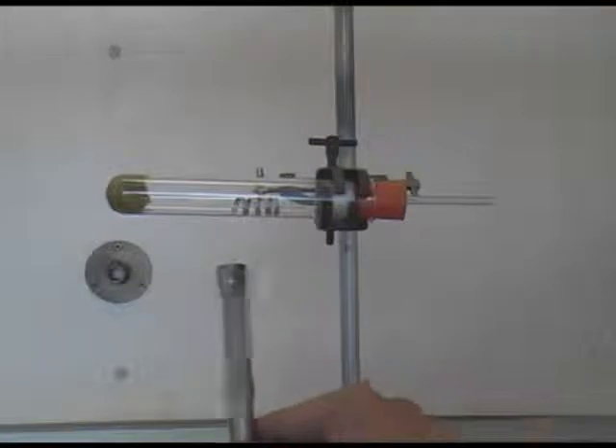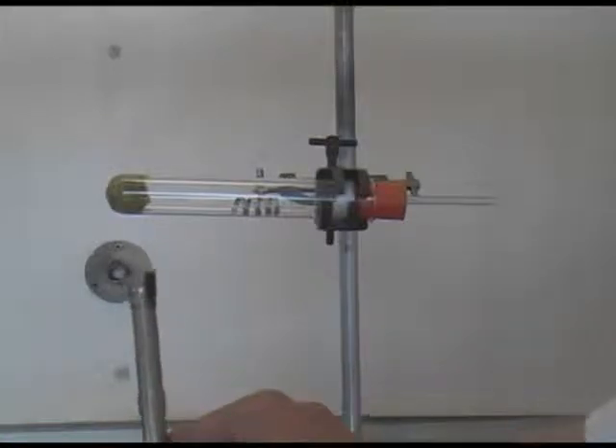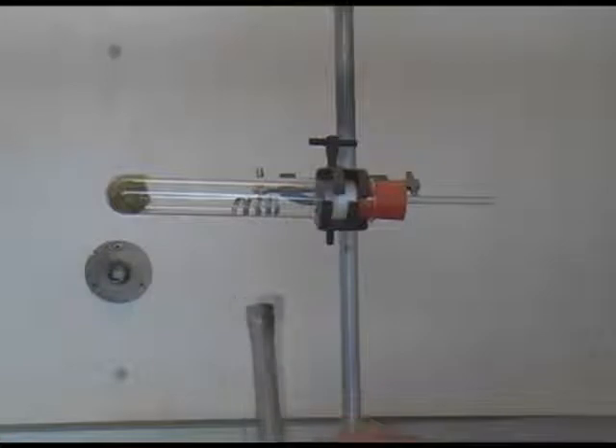Magnesium is a less reactive metal than sodium. It doesn't react very quickly with water, but it does react with steam. We are producing the steam by heating some wool at the bottom of the tube, which is soaked in water. Once the steam is being produced, we can then heat the magnesium to get the reaction going.